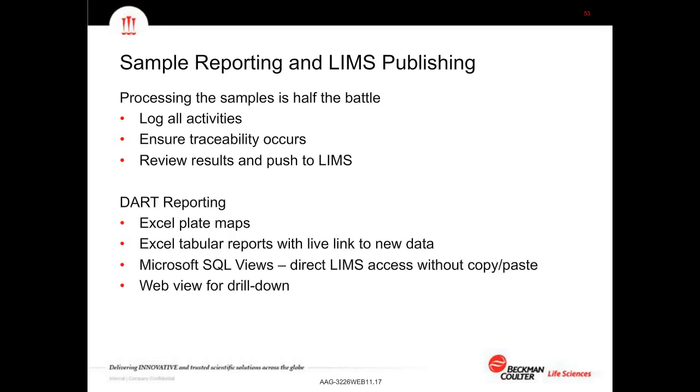One would be an Excel plate map or a tabular report. We can also create Microsoft SQL Server views, and that would be a direct LIMS access, and we wouldn't need any copy-paste through that. We can also use the web for direct drill down, and we can take a look at that. Here's the data acquisition reporting tool.